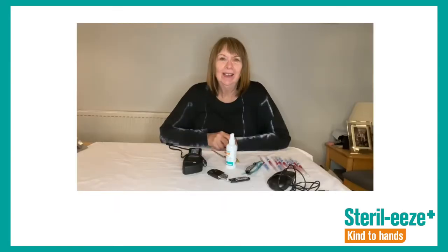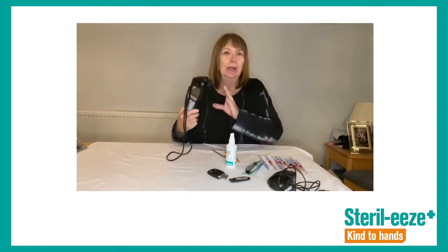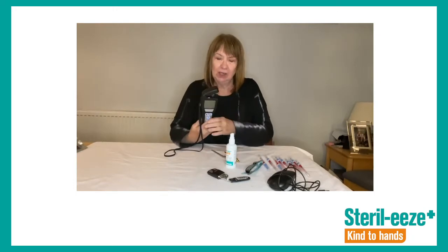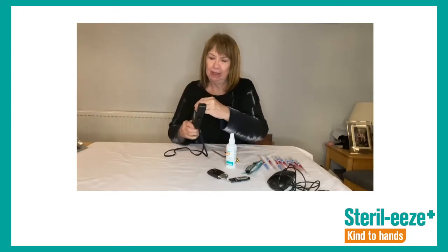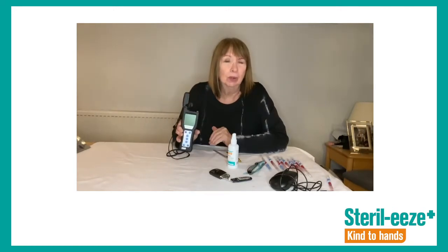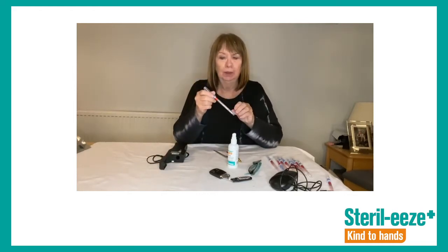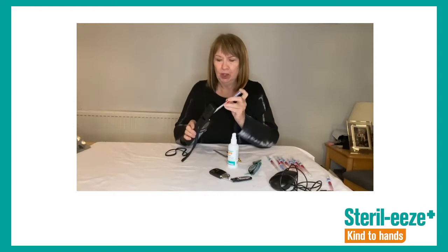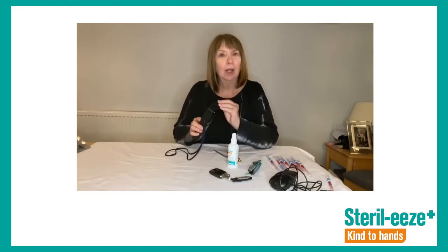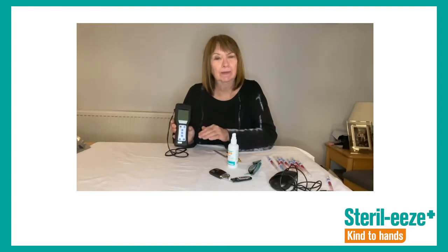Hi, I'd like to explain how we use an ATP monitoring machine. It's very simple. This machine is set up to read light, and it reports in relative light units. We can swab a surface with a very specific swab and then place it into the machine and get a result within 15 seconds, and it reads it as relative light units.